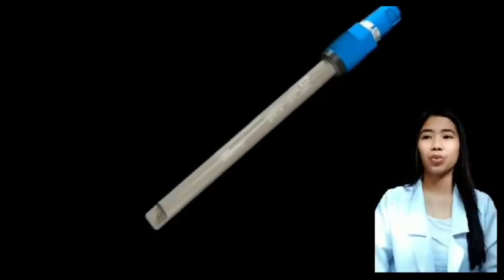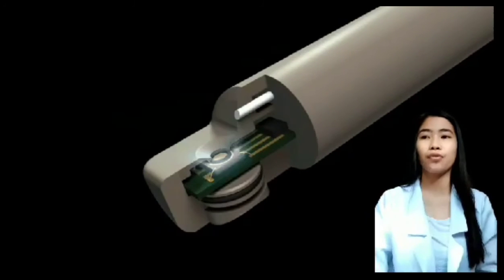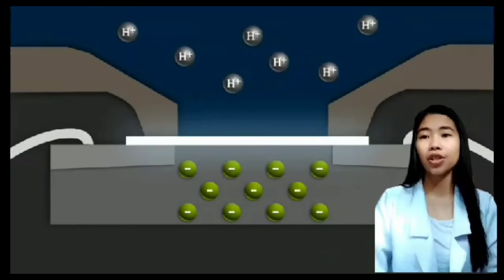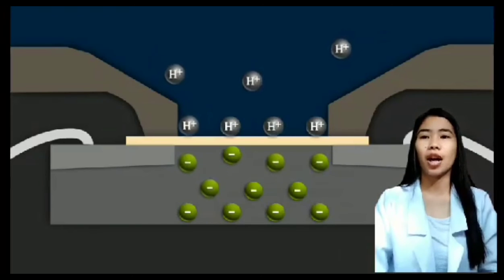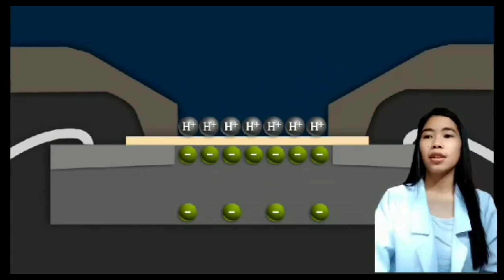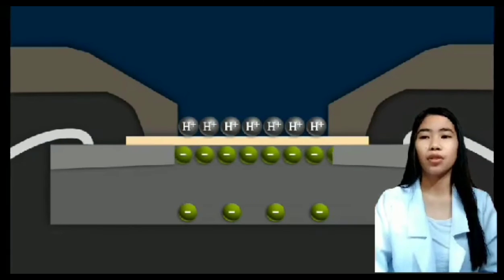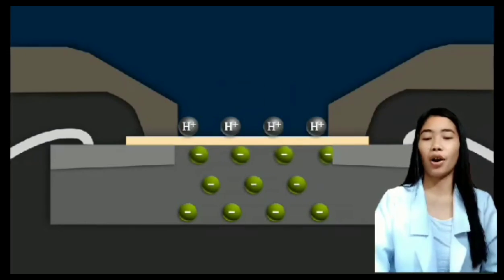The pH measurement with non-glass sensors is based on so-called ion-selective field effect transistors. They use a MOS transistor arrangement that contains a pH-sensitive layer instead of a metal gate. Positive hydrogen ions forming at this layer cause the charge to be separated on the other side. As a result, the area between source and drain becomes conductive. The resulting flow of current is in direct proportion to the pH value of the medium.